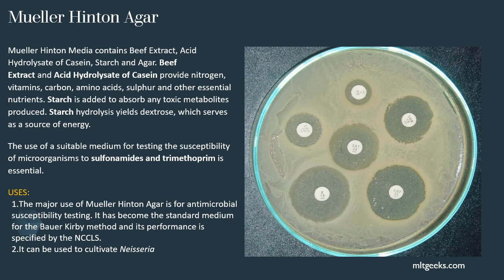The use of this suitable media for testing of susceptibility of microorganisms to sulfonamides and trimethoprims is essential. So to have susceptibility testing of these groups of antibiotics, widely Mueller-Hinton, that is MH agar, is used. I hope you have done this in your practicals.